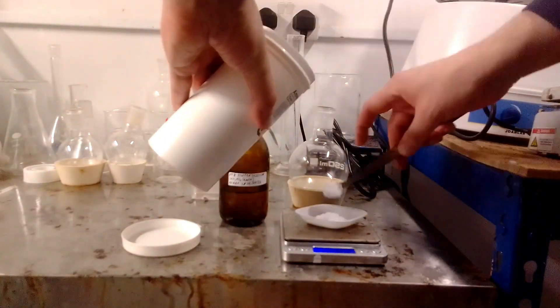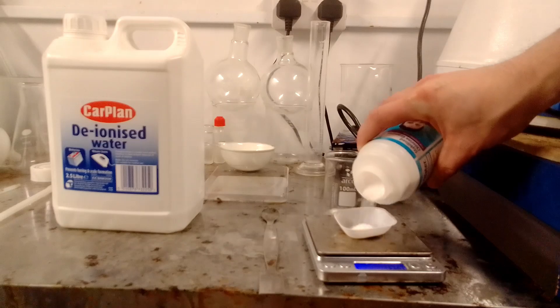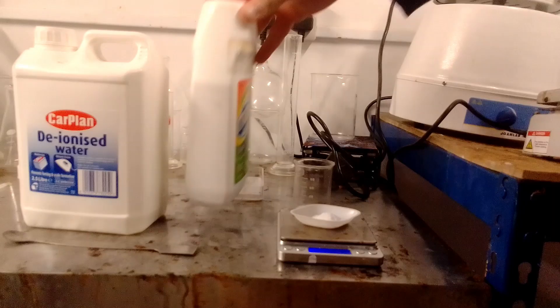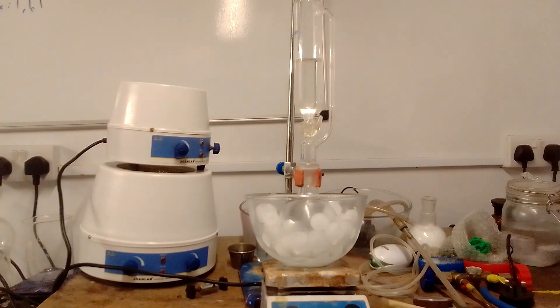Ammonium chloride was dissolved in a pH 8 buffer solution in a round bottom flask and cooled to fridge temperature. Meanwhile, SDCI was dissolved in 60 grams of water, and caustic soda was dissolved in 39 grams of water. The caustic soda solution got pretty hot and was also cooled to near fridge temperature. An ice bath was set up and the SDCI solution was slowly added to the ammonium chloride solution via dropping funnel.